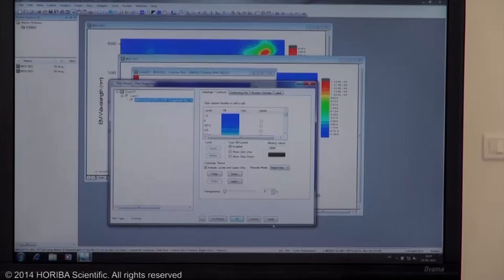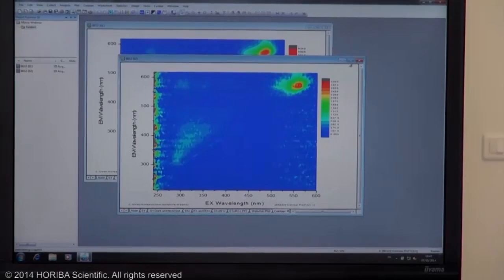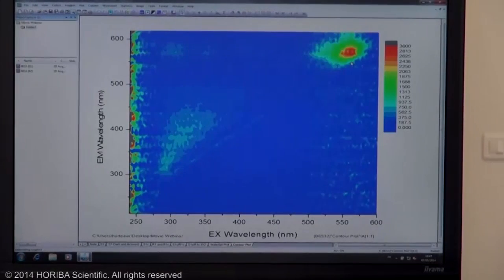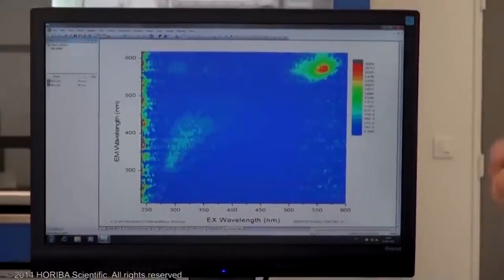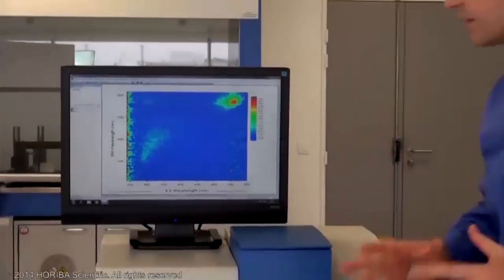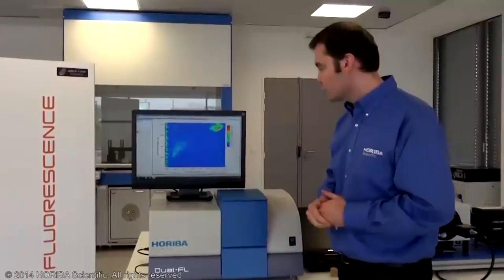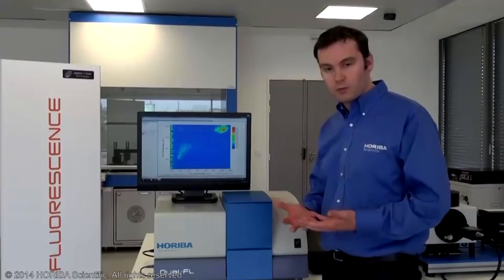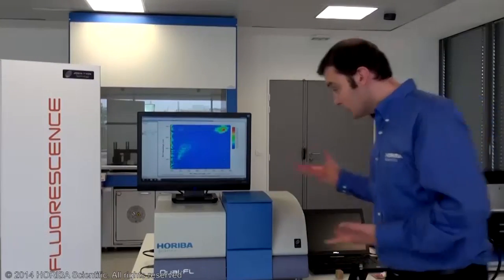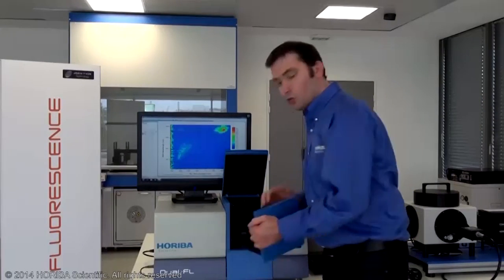So this is something which is automatic, and we can, of course, make it easier to use for you. But it's just to show you a little bit how to deal with the software. So we recover the data. Again, it's a little bit noisier, but we get the data, and it was very fast compared even to the first measurement. And again, it's definitely faster than what we can get with the PMT.